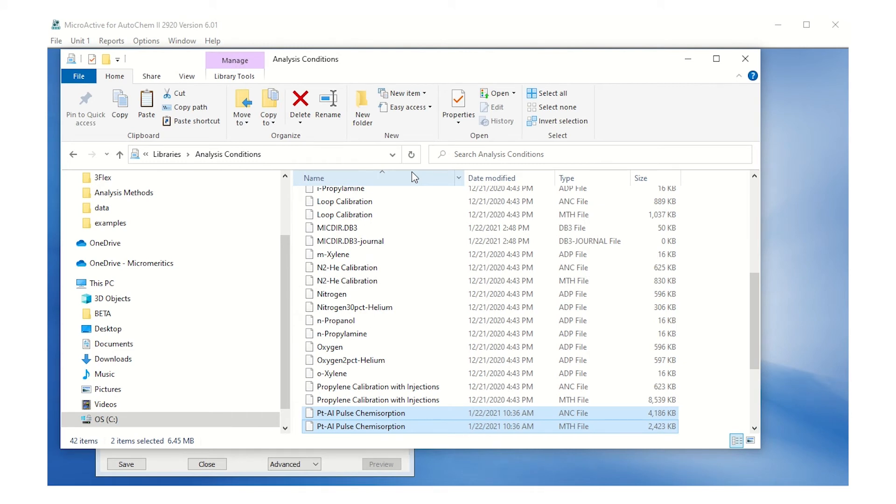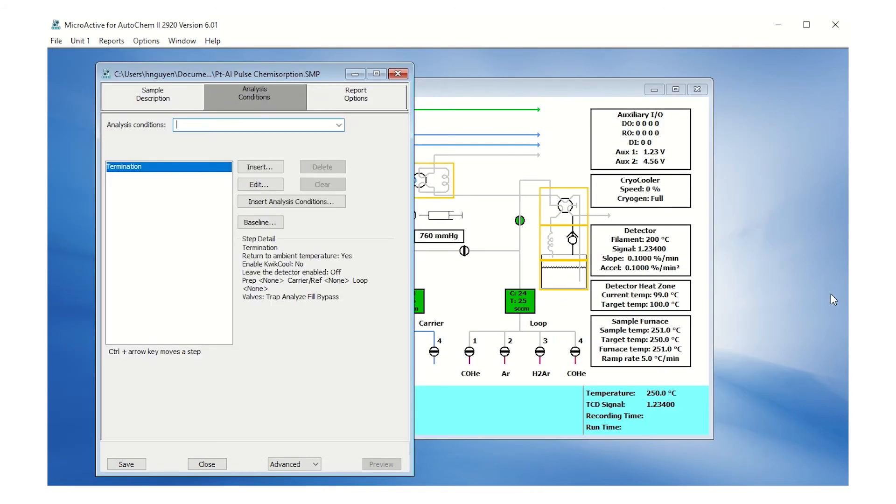The Analysis Conditions are now updated. Go back to the AutoChem software window, select the drop-down box and select Platinum Alumina Carbon Monoxide Pulse Chemisorption.